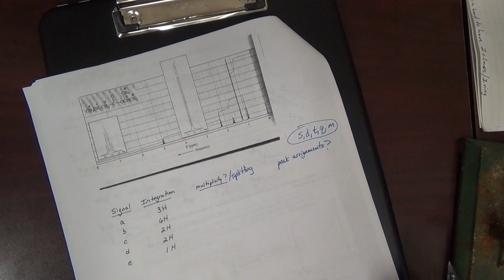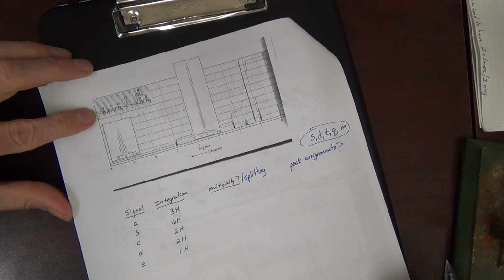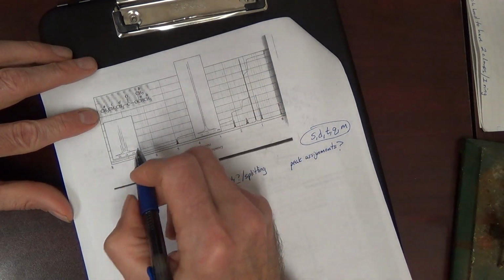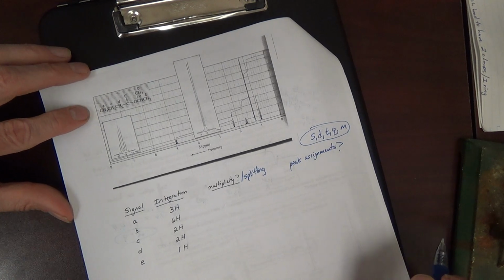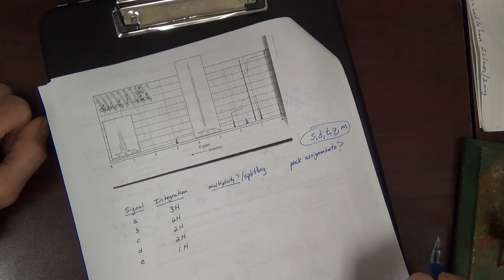I'll do the first one for you to show you what I mean, to make sure it's clear. Which signal do I expect to be more downfield? Which of these signals is most downfield?